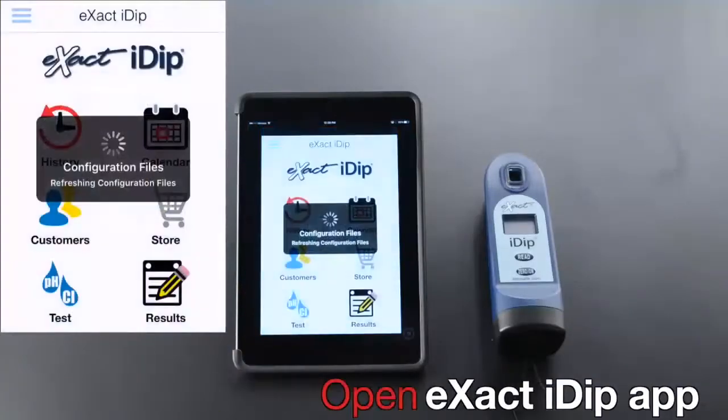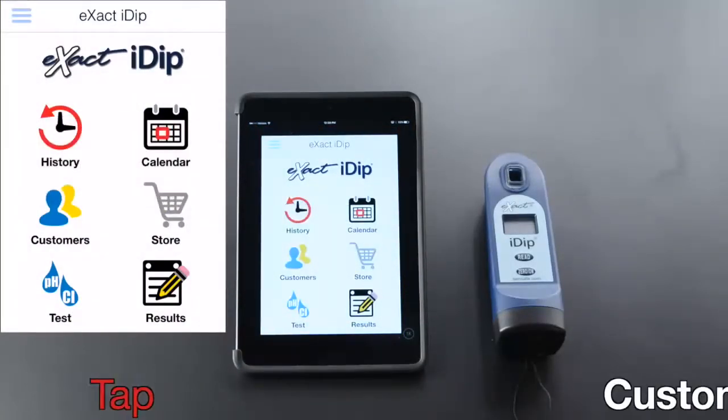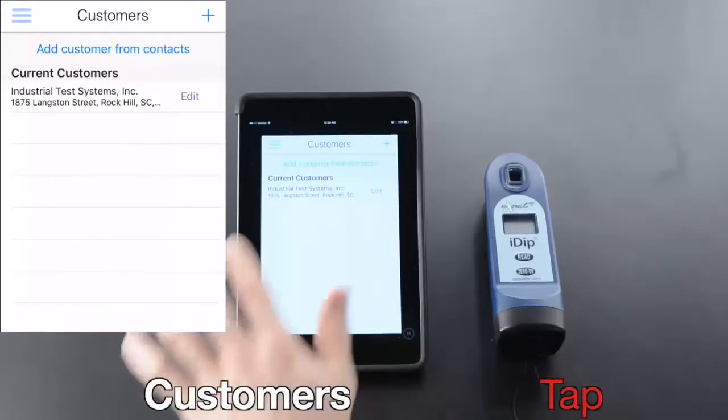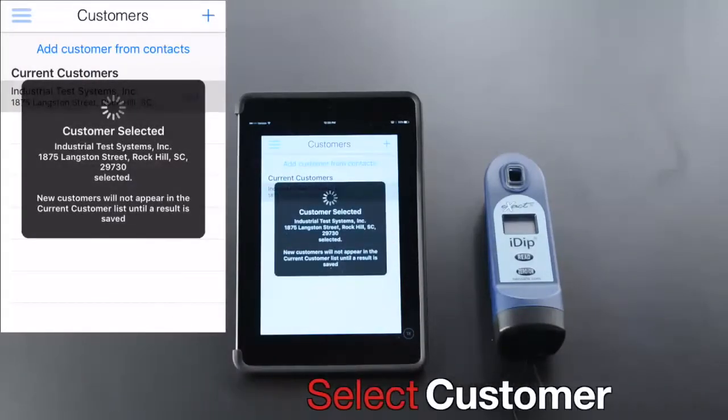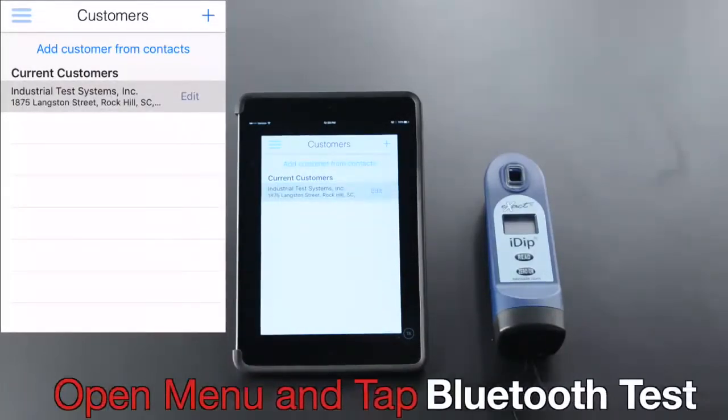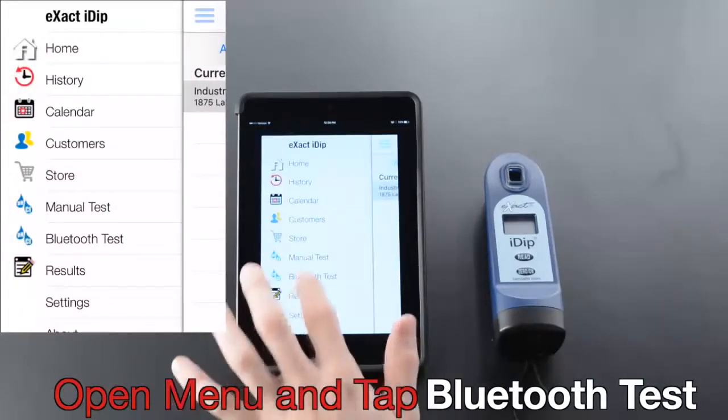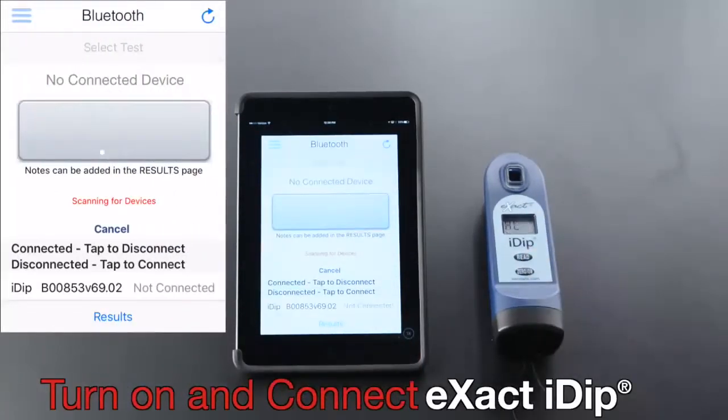Open the eXact iDip app, tap customers, select customer, open menu, and tap Bluetooth test. Turn on and connect eXact iDip.